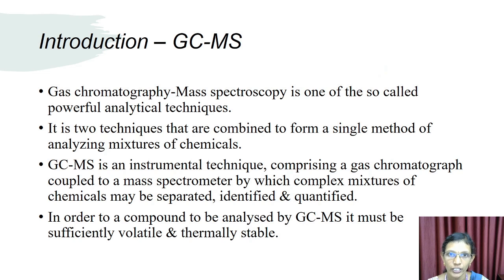Students, today we are going to continue with chromatography techniques. Today we are going to discuss GCMS and LCMS. GCMS is a high and powerful analytical technique. It is one of the physical methods.